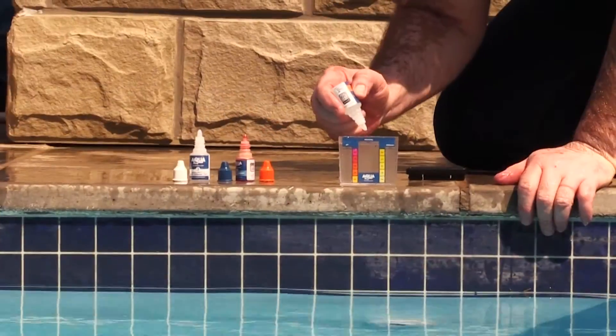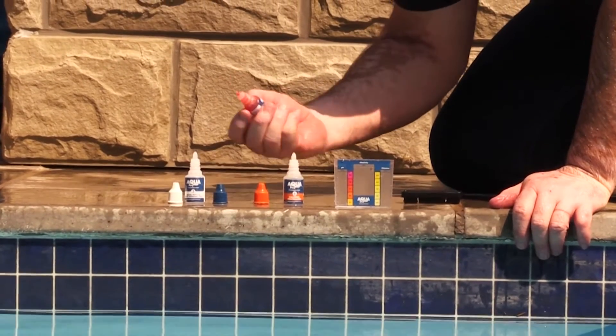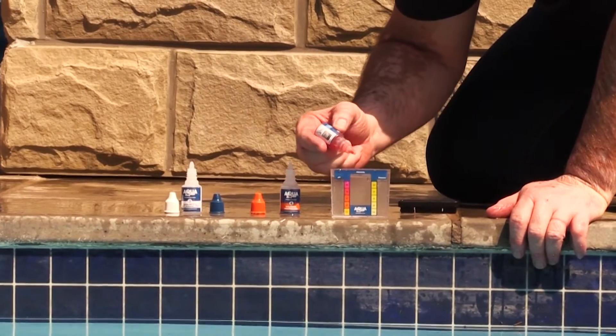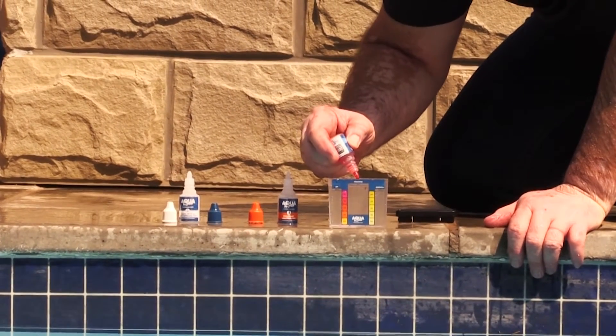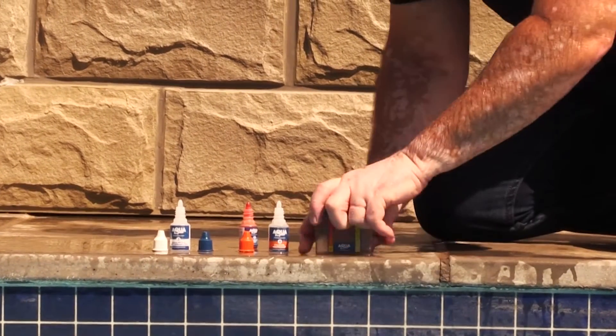Add 1 drop of solution 4, then add 1 drop of solution 5. Place the lid on the vial and shake gently to mix in the solution.